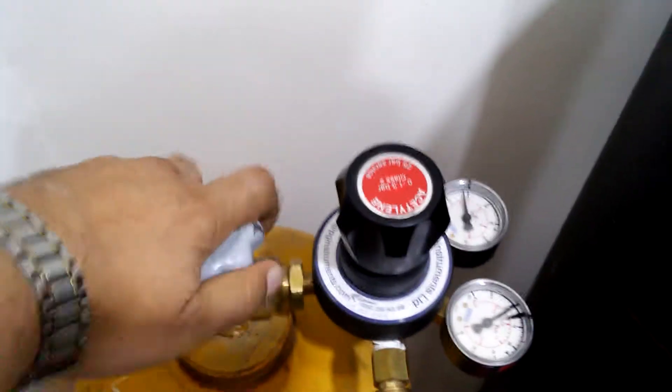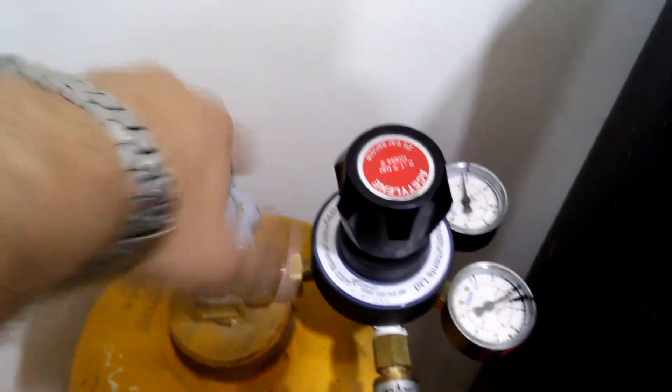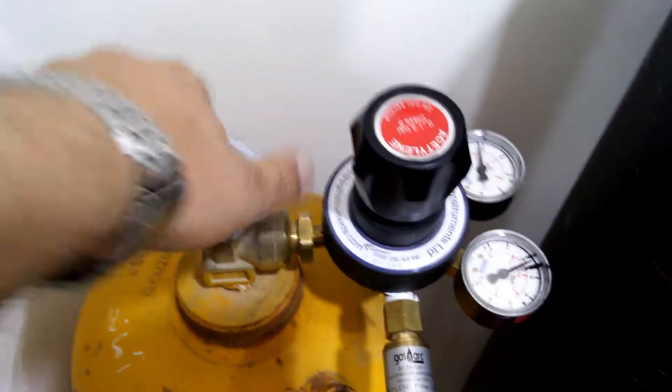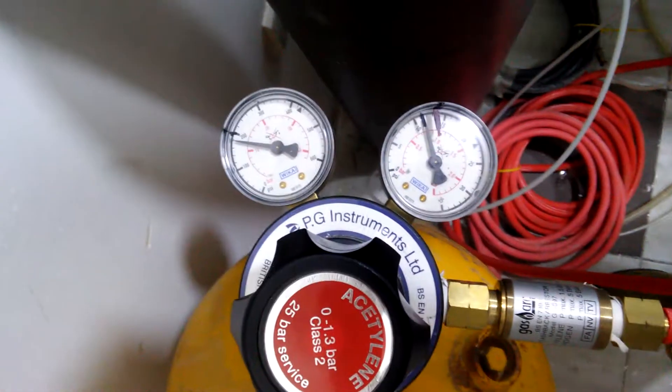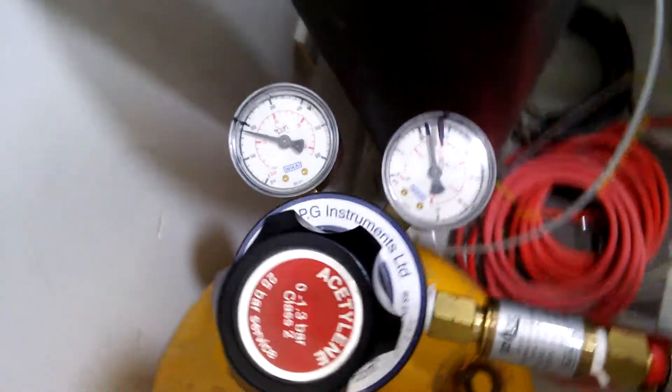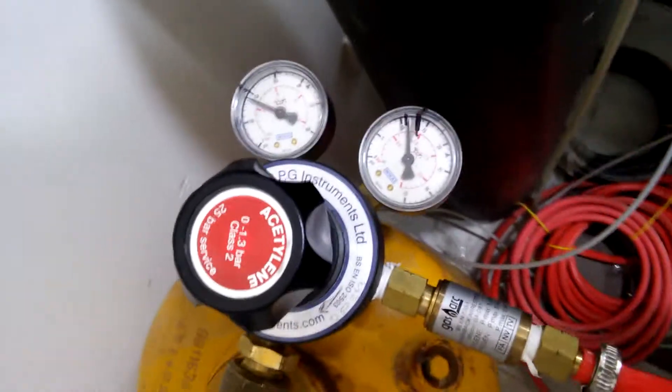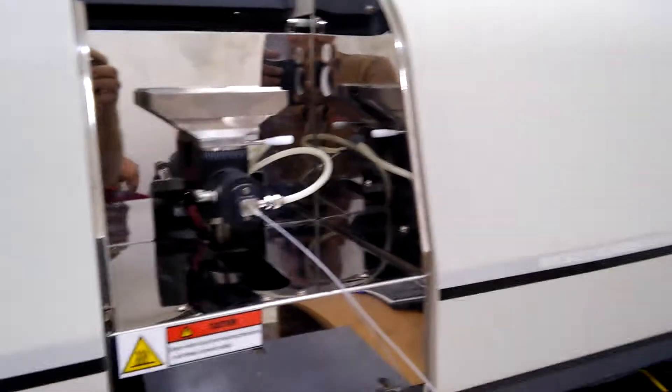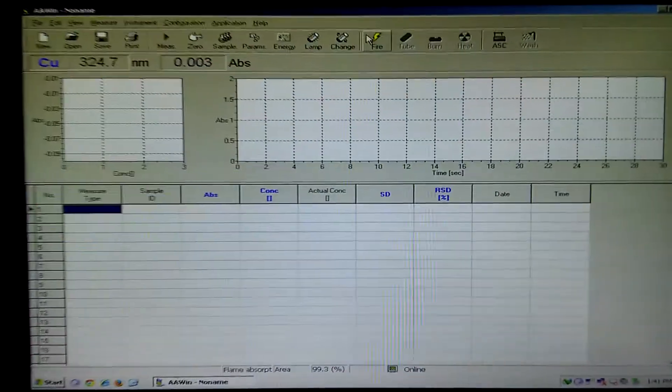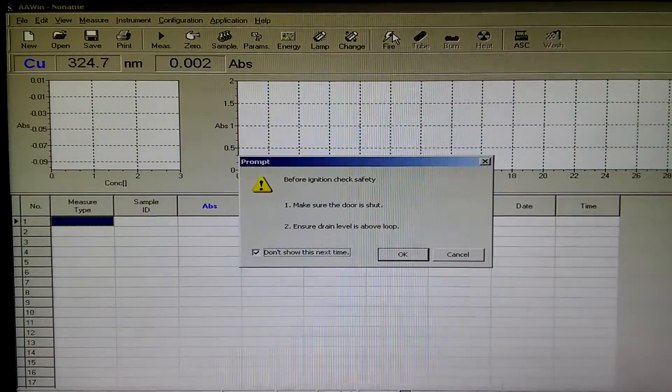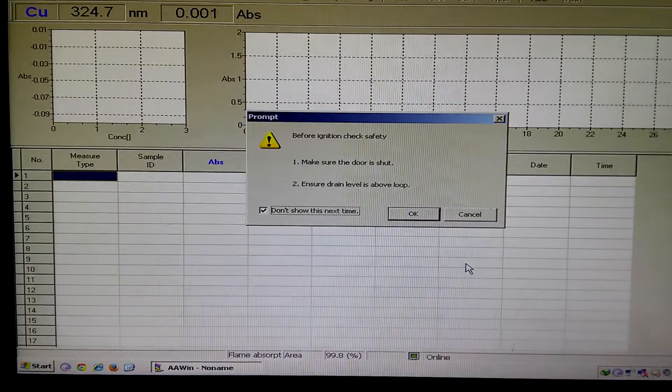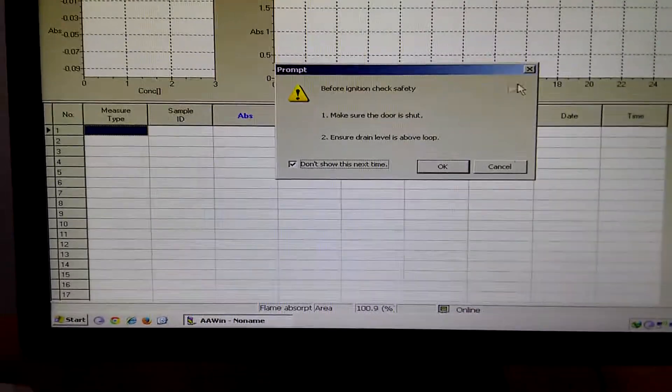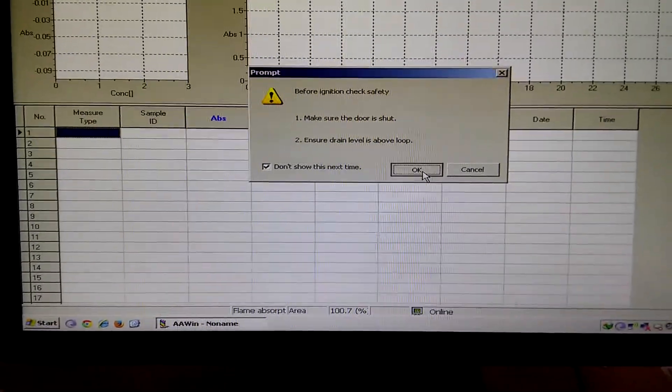Now we have to check the cylinder of the acetylene. This is the acetylene cylinder, so we have to open it. These are the gauges. Now we are going to ignite the instrument. Press ignite, press okay.